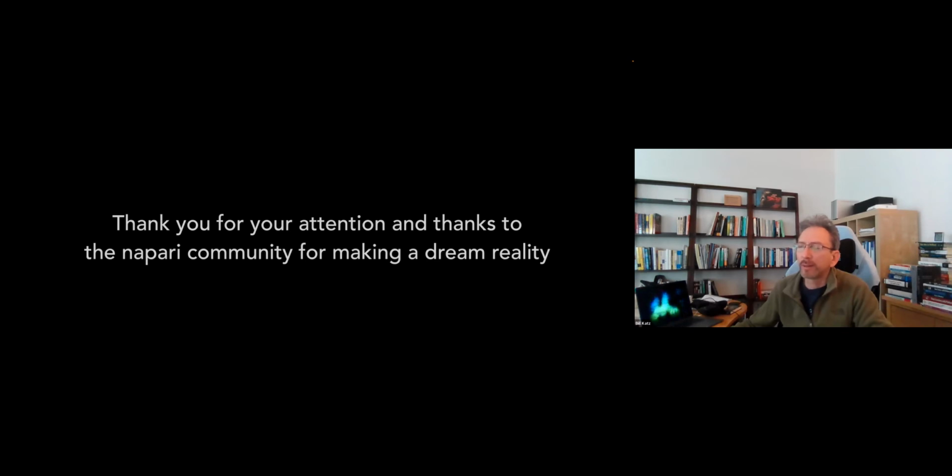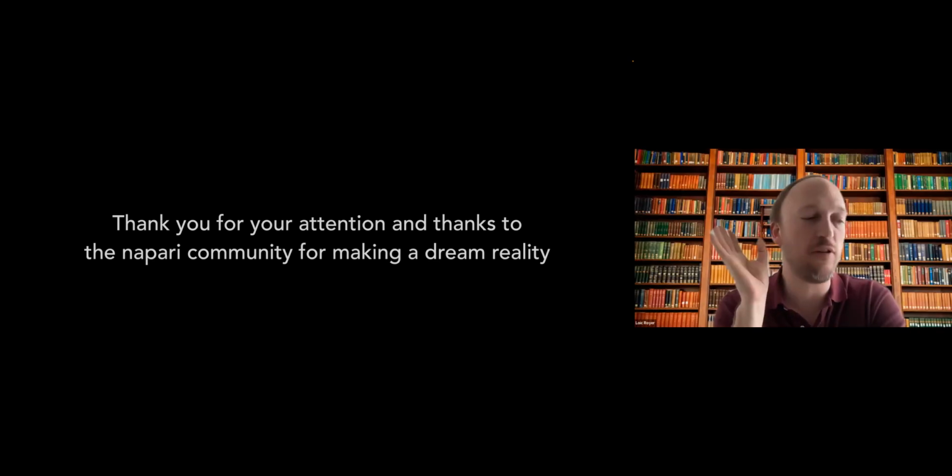Sure. I was curious about all the annotations that you're generating in Napari, how you persist them between sessions. So what is the mechanism? It's all NumPy, right?